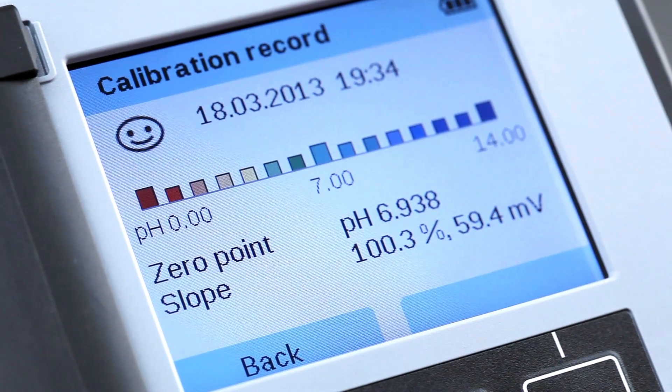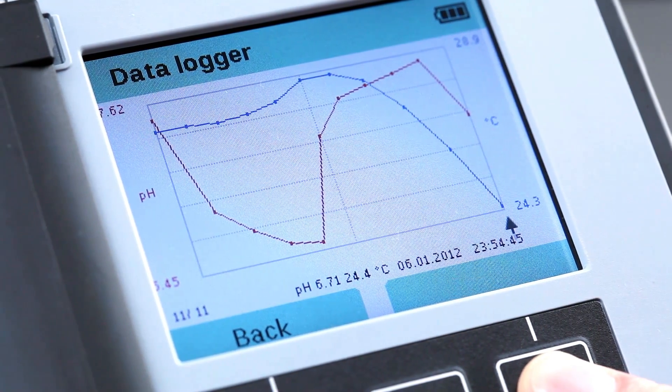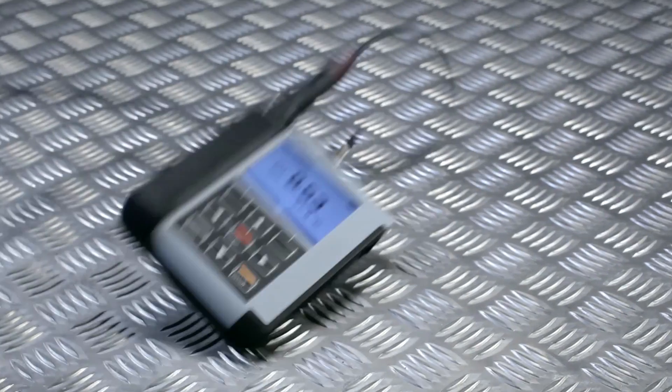Easy sensor calibration also on site. Intelligent data logger for up to 10,000 entries. Extremely robust housing.